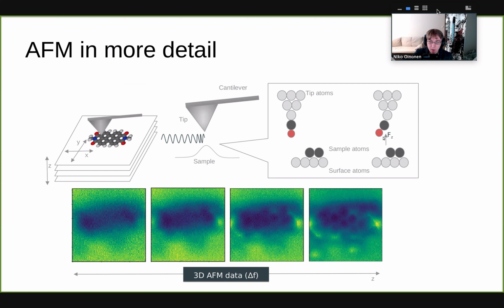And it's also chemically inert, so that it doesn't chemically react with the sample. With the bare metal tip, it's often a problem that when you go close to the sample, it's easy to disturb the sample, and if it's delicate, the sample might, for example, jump onto the tip. So this functionalization is really important.